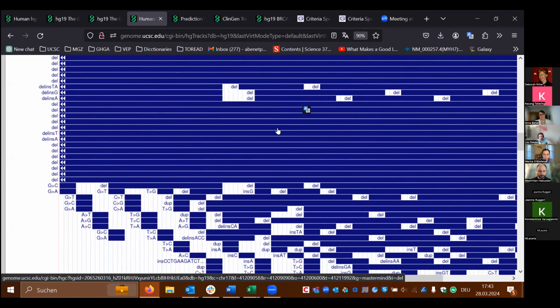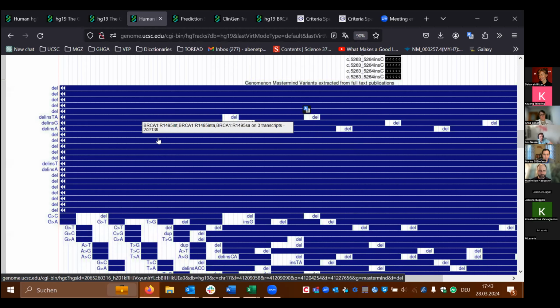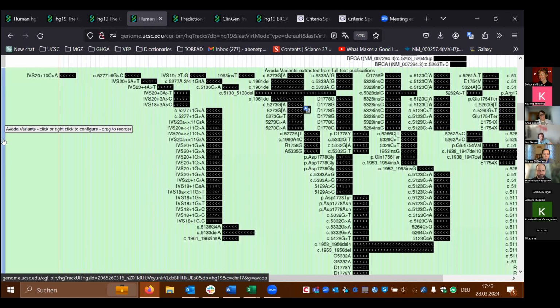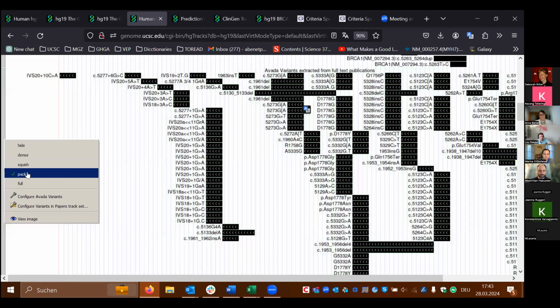If you collapse it, you can get a sense of where the data you're looking for is, but it's not this long vertical distance across your screen. They've preset which ones they think you want in pack versus full, but you have the ability to change those and it can really make a difference.